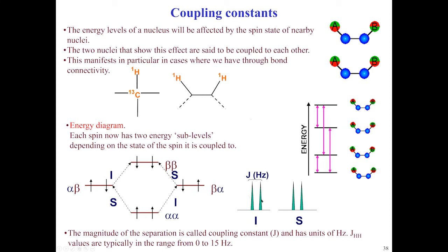And that will indicate, for one, that this particular atom has at least one neighbor, or actually exactly one neighbor, that it's coupled to. And that partner will also have the same. So this is a wonderful tool to identify such groups. Just a little note, this for beginners is a problem. This also works with heteronuclei, and it works with single bonds. When you start reading, typically it would be this, but this of course is general.